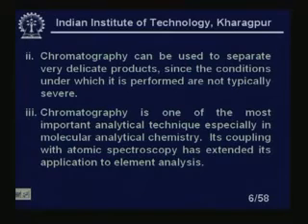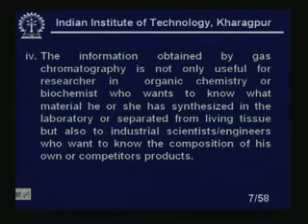Chromatography is one of the most important analytical techniques, especially in molecular analytical chemistry. Its coupling with atomic spectroscopy has extended its application to element analysis. So, with the advancements in atomic spectroscopy, we can also identify elements. The information obtained by gas chromatography is useful not only for researchers in organic chemistry or biochemists who want to know what material they have synthesized in the laboratory or separated from living tissue, but also to industrial scientists and engineers.